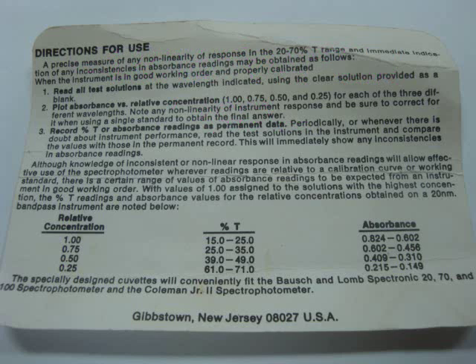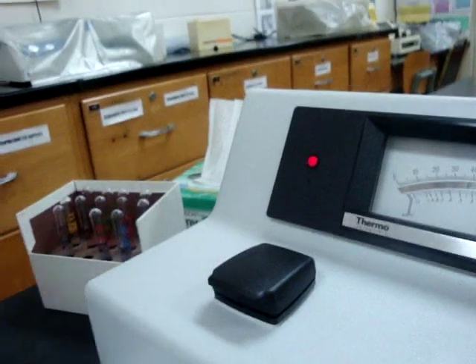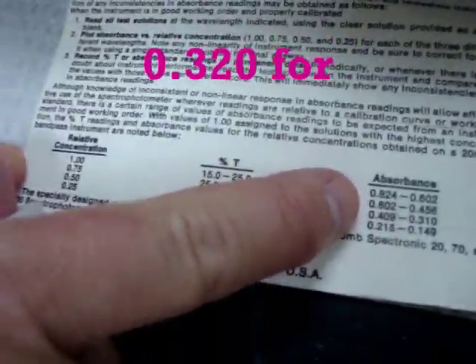On the reference sheet, the 0.25 concentration should read between 0.149 and 0.215 — it falls within that range. Next, take the 0.5 concentration, wipe the fingerprints off, place it in the sample compartment, close the door, and take the reading. The 0.5 reads 0.32, and the chart shows it should be between 0.310 and 0.409 — within range.